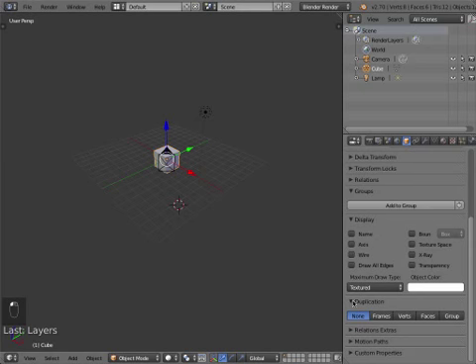And the most important thing for visualization we're going to have on this tab here is duplication. So what that means is that for whatever object you have, you can duplicate other objects on the vertices of that object or on the faces or other properties. So what we're going to do is load in our atom probe data as a mesh with only vertices. Then we're going to create one sphere that's going to represent the atom, and we're going to vertex duplicate that sphere. And that's how we do the visualization if we use spheres.